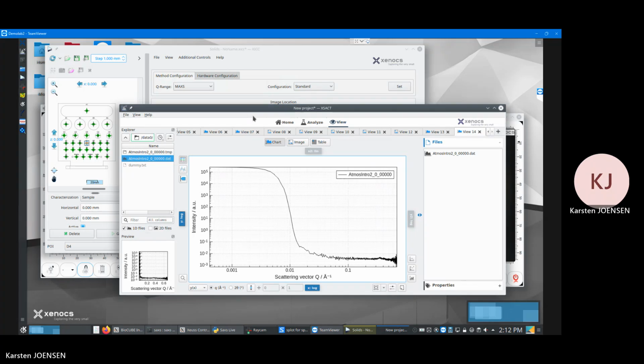Now, if I look at this Kapton peak again, we can see it's between 0.3 and 0.4. This is not accurate for Kapton because this is the Kapton on the window, and of course the window is not in the same position as the sample. So that will have been shifted from where you'd ideally expect the Kapton peak.